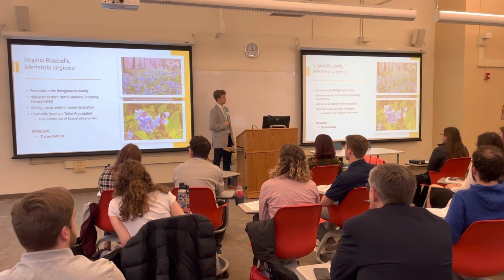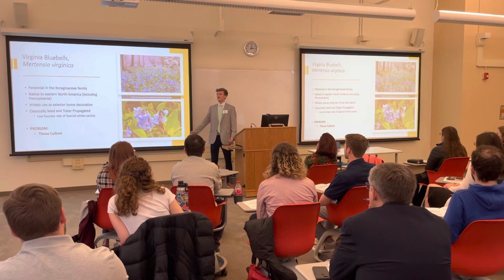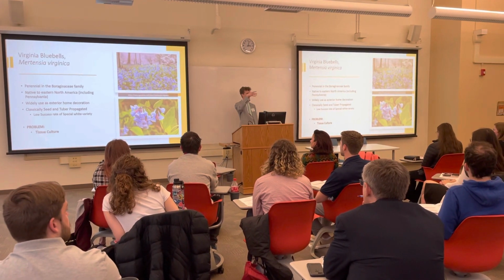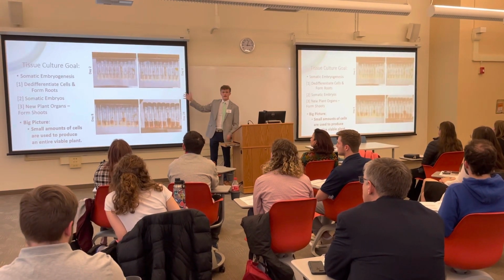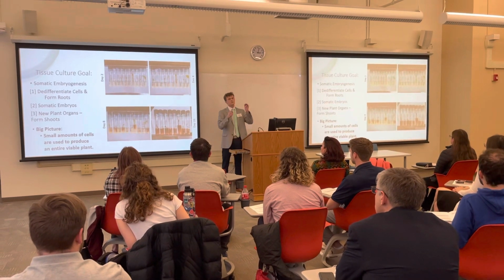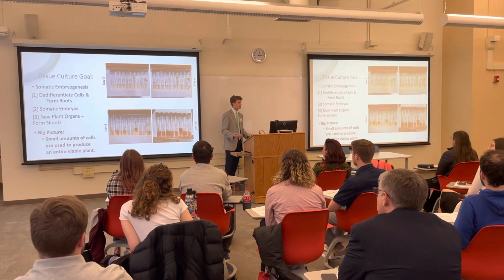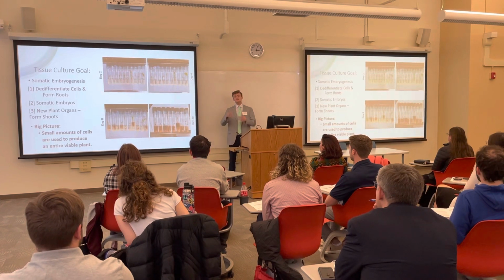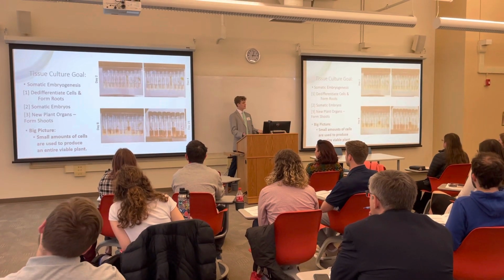Our lab has tried for the past almost decade to initiate these guys into tissue culture, and we've been unsuccessful, except for one singular case out of thousands. So, tissue culture, the goal is you're going to take them in a lab setting. You're usually going to take a cutting of the plant, put it into an agar-based media with all the necessary nutrients and things, and grow it from scratch, right? This is actually going to do it a lot faster than, say, seed propagation, which is why it's so valuable to us.